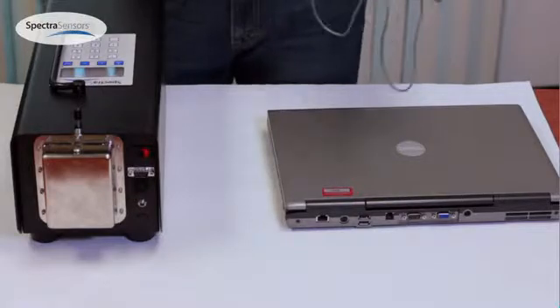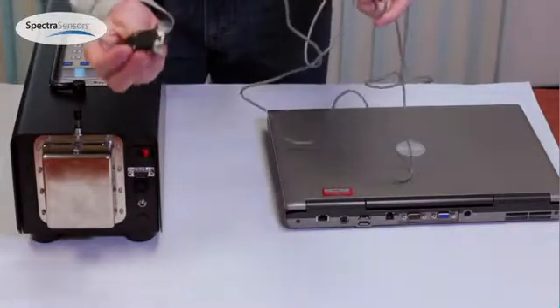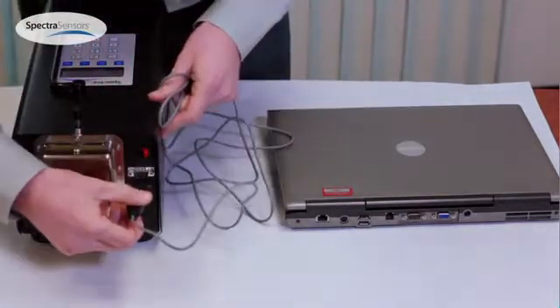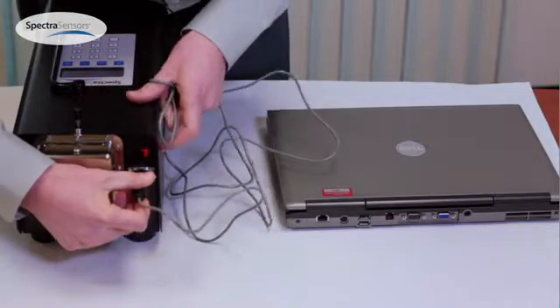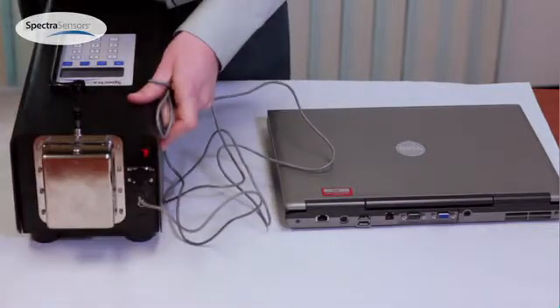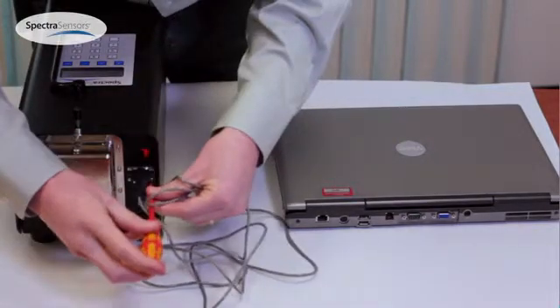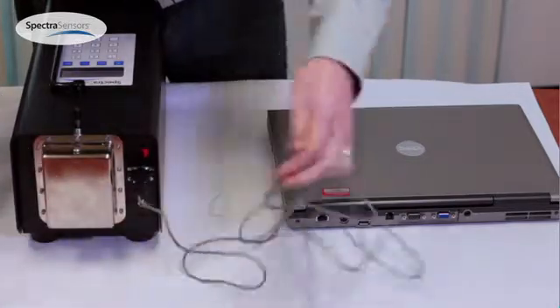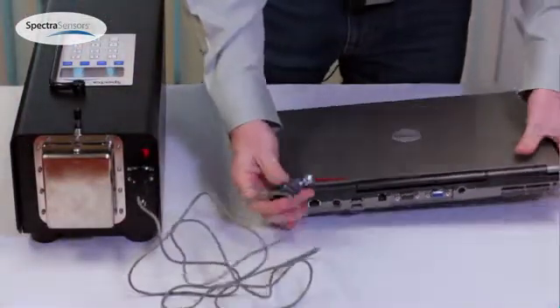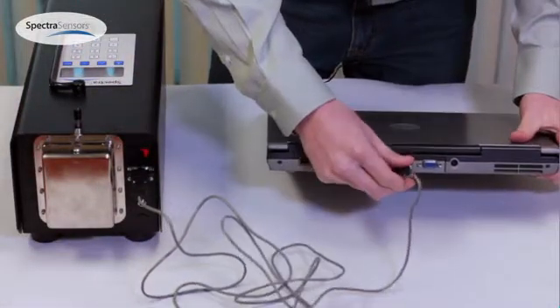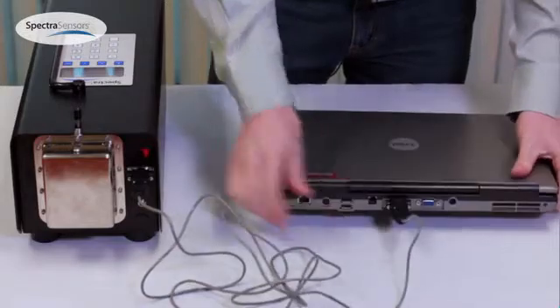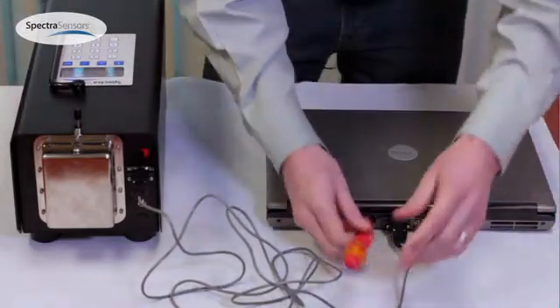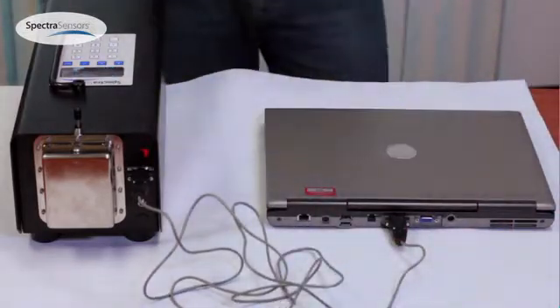To connect to your analyzer you're going to take one end of the serial cable, doesn't matter which one, and plug it into the DB9 port on the outside of the analyzer. You can tighten down the screws and take the other end and plug it into the serial port on your computer. Again tighten down the screws and you're ready to take the data download.